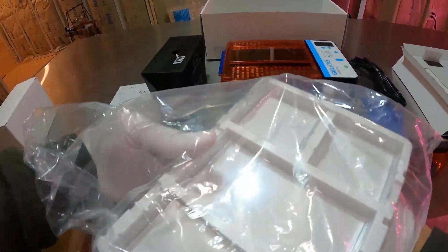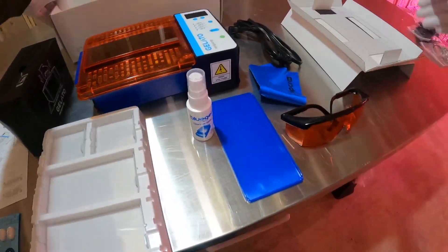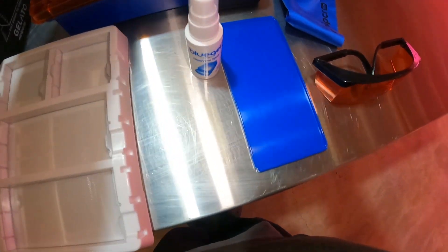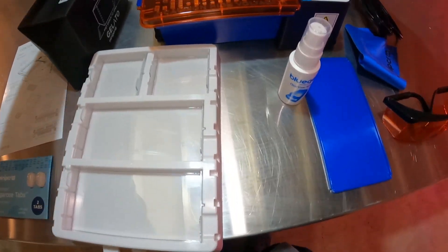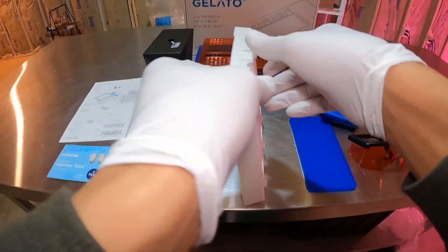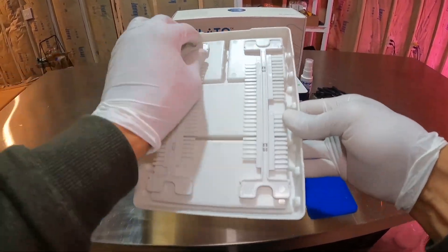Here we have our casting tray — this is where we pour our agarose gel. On the bottom it has a nice little area to store your combs. Your combs are what you're going to use in the gel to put the wells in, where you're going to be putting your DNA, your ladders, and things like that for running your gel electrophoresis. I really like these casting systems — they have two different sizes and a lot of different comb variations.